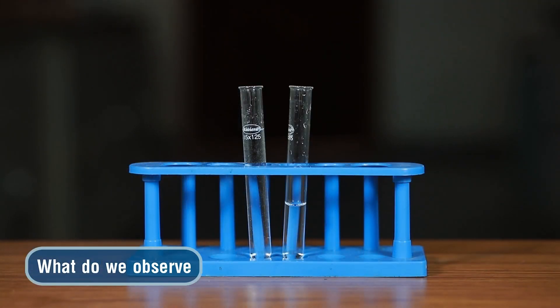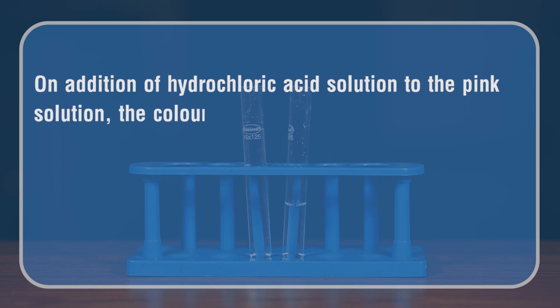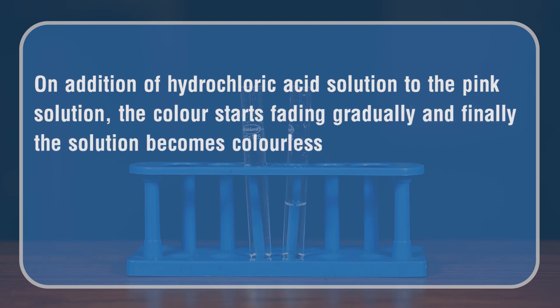What do we observe? On addition of hydrochloric acid solution to the pink solution, the color starts fading gradually and finally the solution becomes colorless.